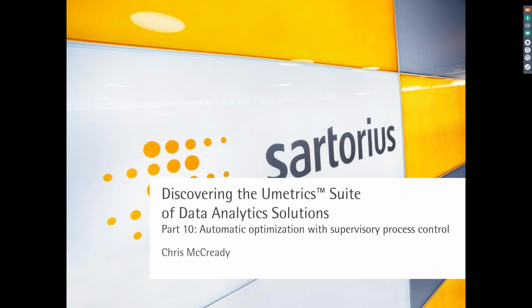So what I will be speaking about today is some of the, I used to say new offerings in SIMCA-online, but now it's been a few years. So these are not so new and fresh anymore, but still maybe new to many of our existing SIMCA-online users, and obviously new to those who are not SIMCA-online users.